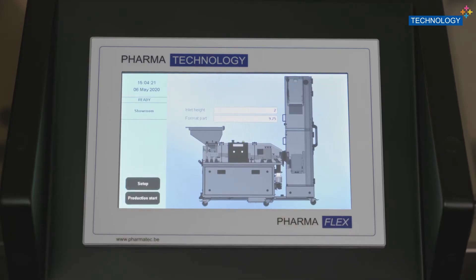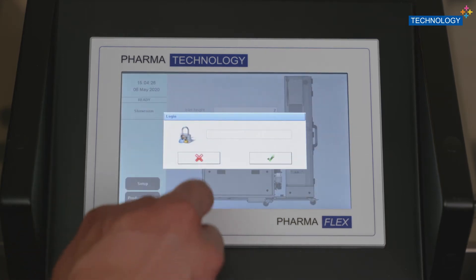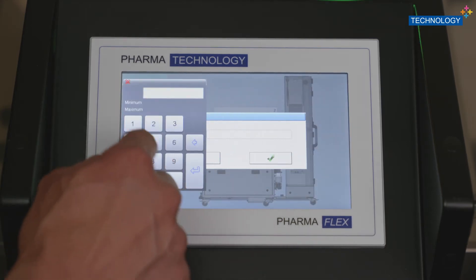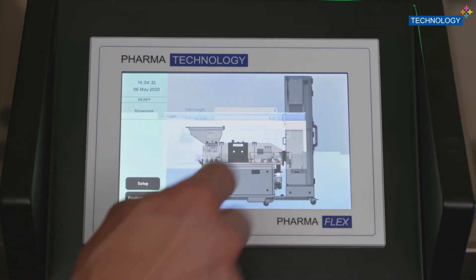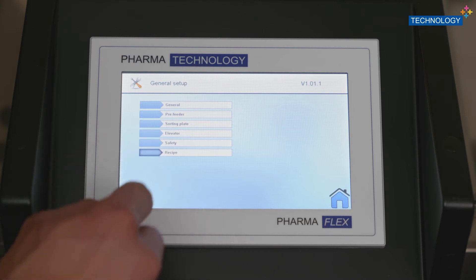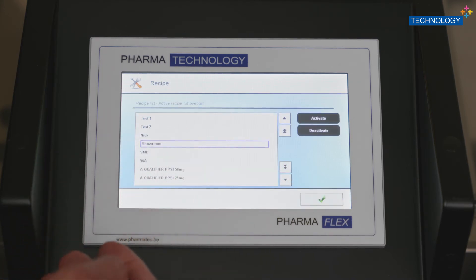We also offer to combine the iSort with a vertical deduster, especially for containment projects. The iSort comes as standard with a very easy, very graphical interface. It also has user management and audit trail functionalities as options, and can be CFR 21 Part 11 compliant. We can see here the recipe management, allowing you to make sure that you always have the right settings and therefore very good sorting.